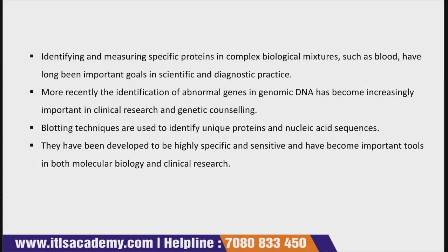We have already discussed clinical research: whenever you want to identify any abnormal gene in a genomic DNA, you use the blotting technique. It has become an important tool for clinical research as well as for molecular biology.